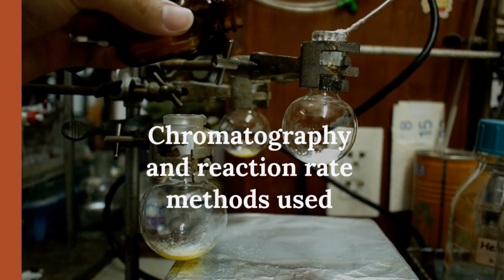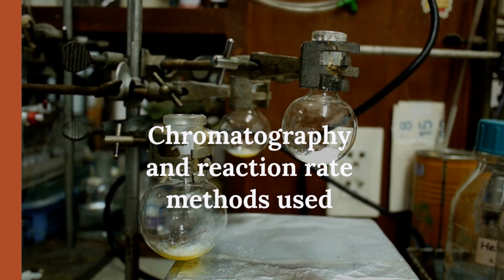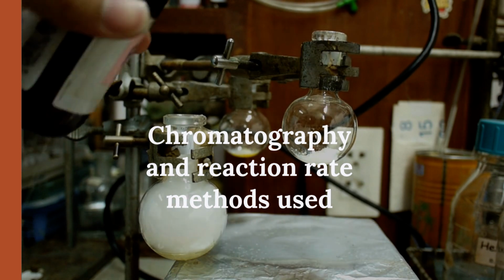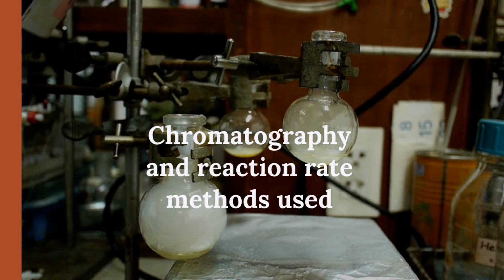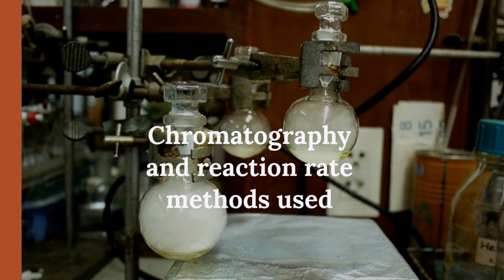Each experiment used specific apparatus and methods for accurate results. Chromatography involved spotting ink on paper and using a solvent. Reaction rate experiments measured time for magnesium to react with acid. Crystallization required heating and cooling a salt solution. pH changes were recorded by adding base to acid and measuring pH.